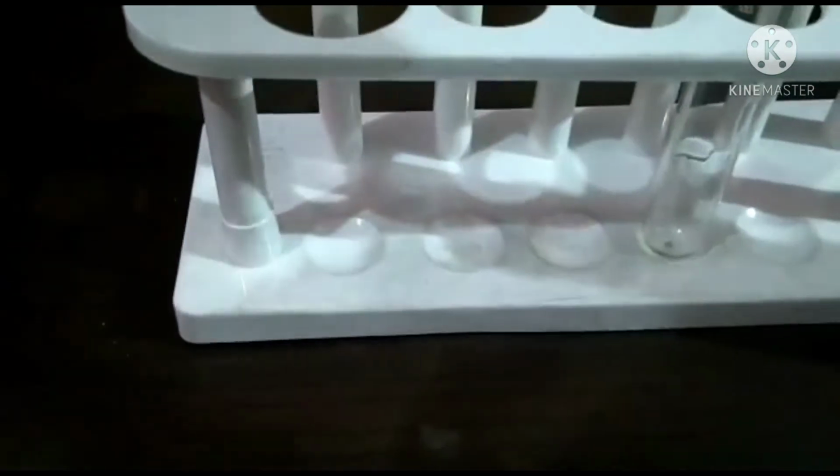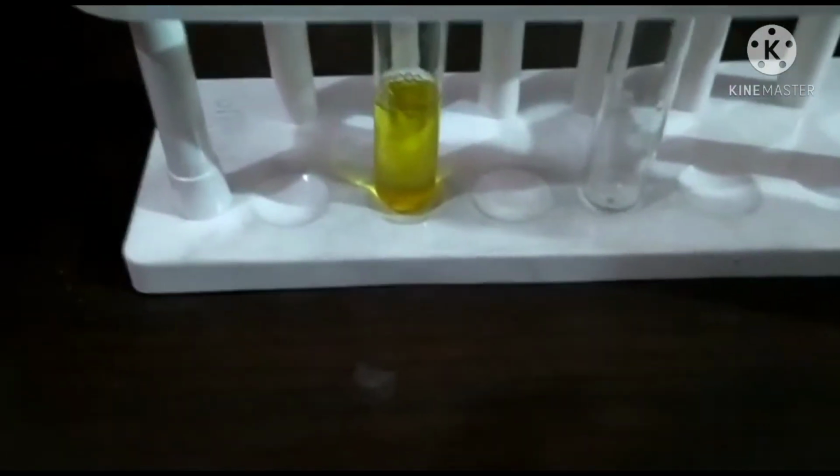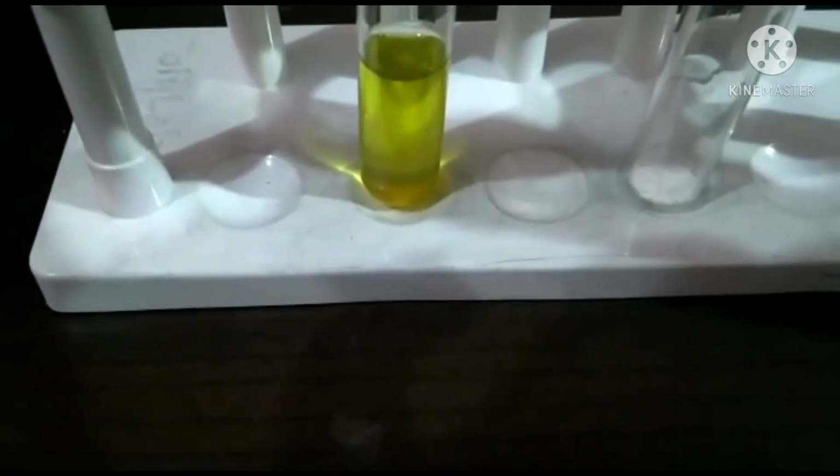Try to make it a homogeneous solution. This is sodium sulfate. Now we will take barium chloride in the second test tube.